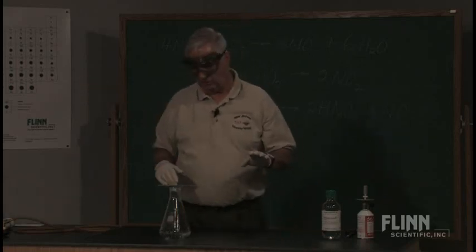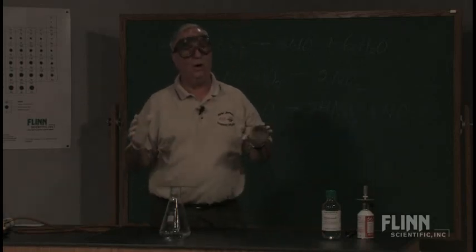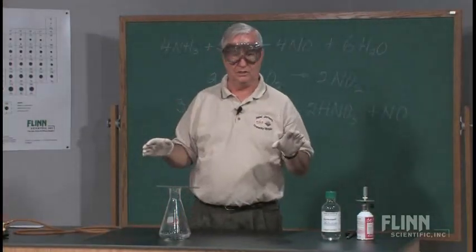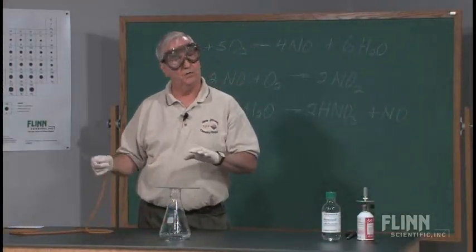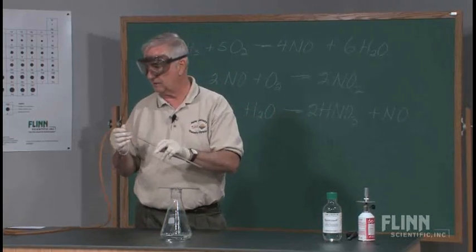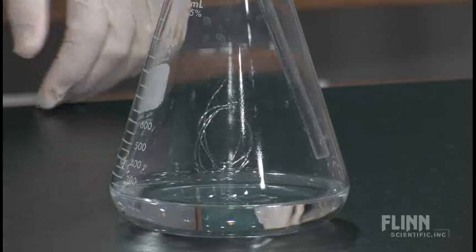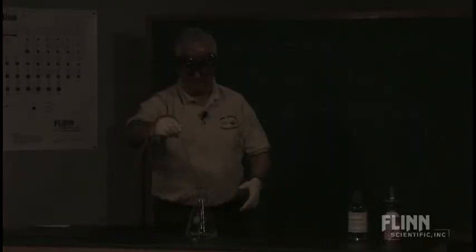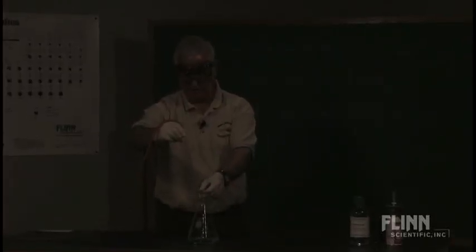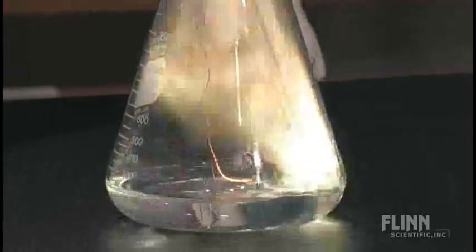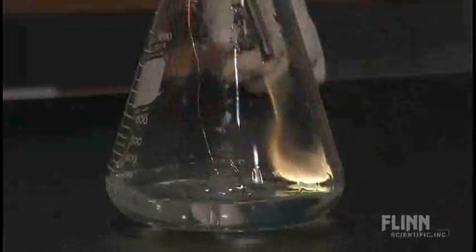So I'm going to ask John to come over and give me a hand here, and what we're going to do is we are going to intentionally enrich the oxygen level from a cylinder of oxygen gas. Ready? Okay. And by bubbling... Whoa. Okay. Told you there might be one. Slow down. There we go.